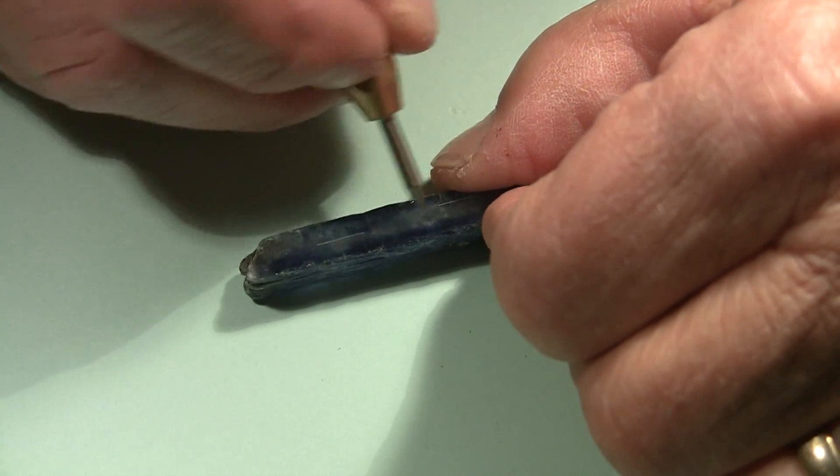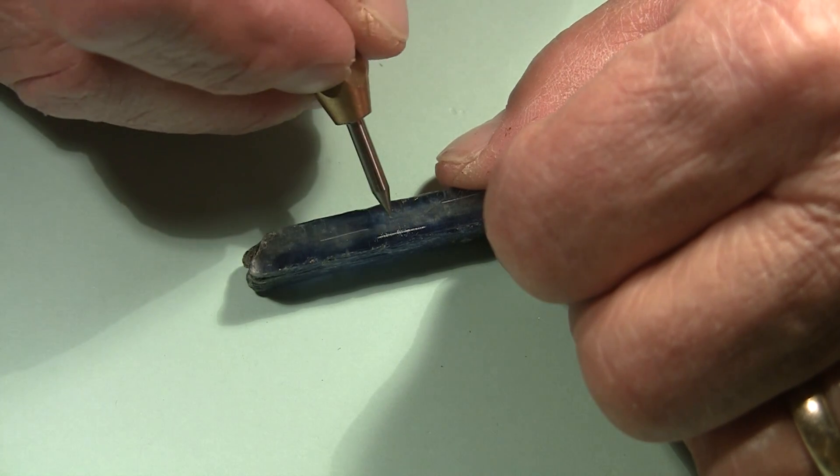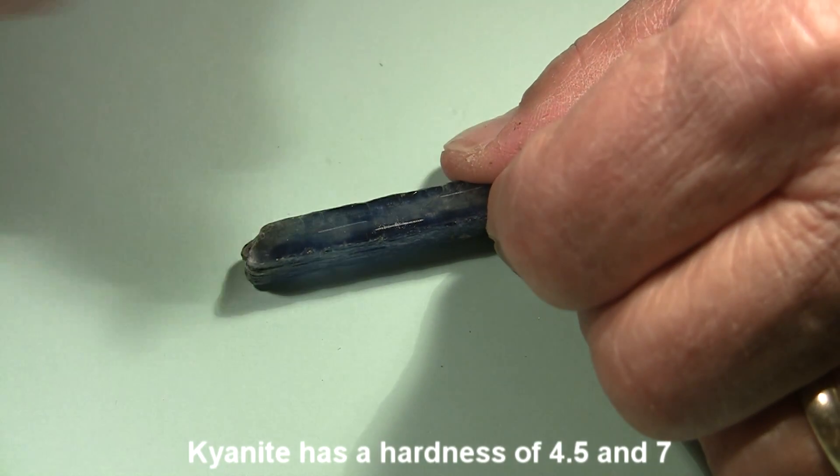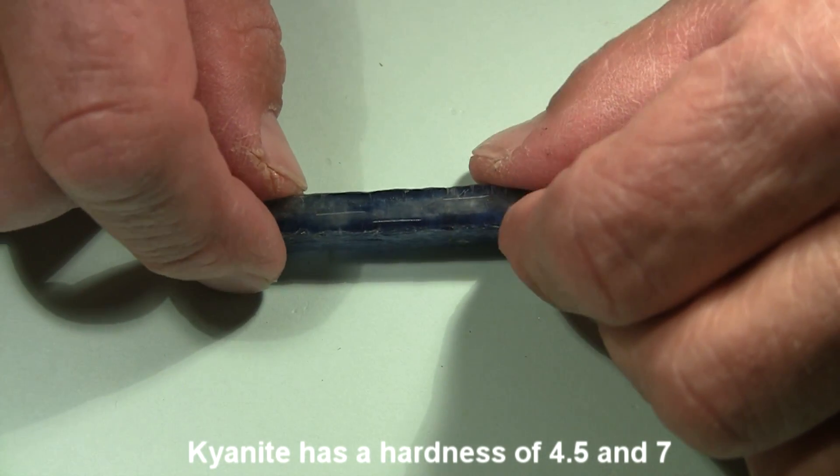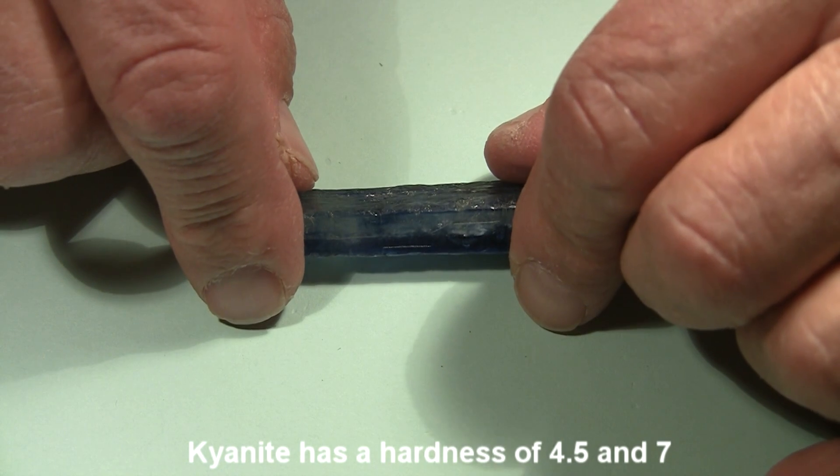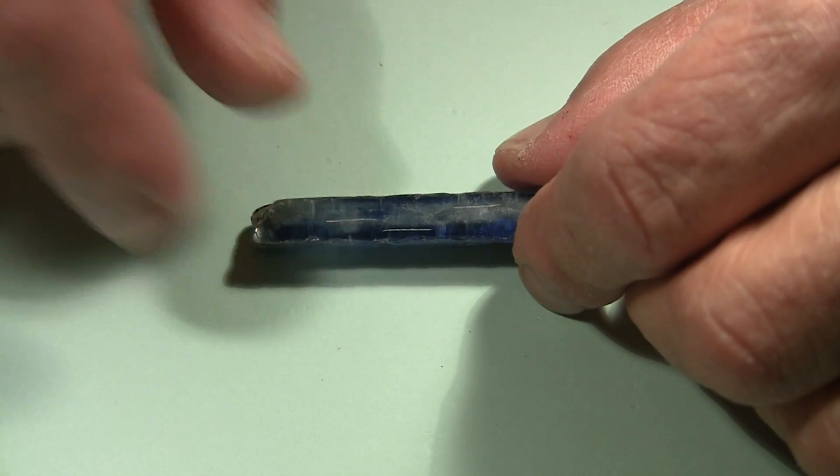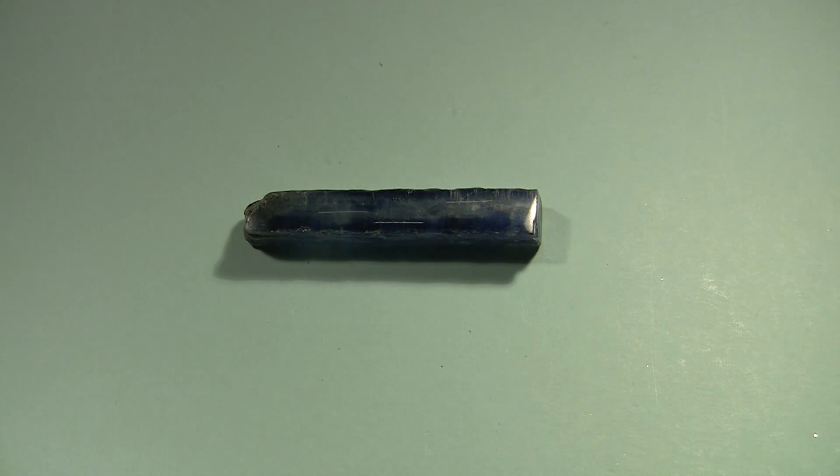So I'll try to scratch it in the long direction. I can hear it digging in. It makes a nice white line that doesn't rub off. That is definitely a scratch on the surface of that crystal. So kyanite has a hardness that is lower in one direction than in the other direction.